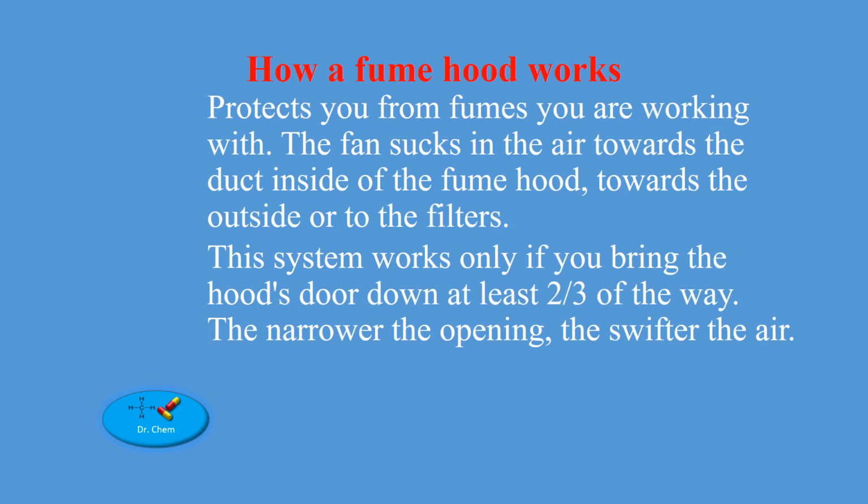How does a fume hood work? It works by protecting you from the fumes you are working with. The fan sucks in the air towards the duct inside of the fume hood, towards the outside, or to the filters. This system works only if you bring the hood's door down at least 2/3 of the way. The narrower the opening, the swifter the air.